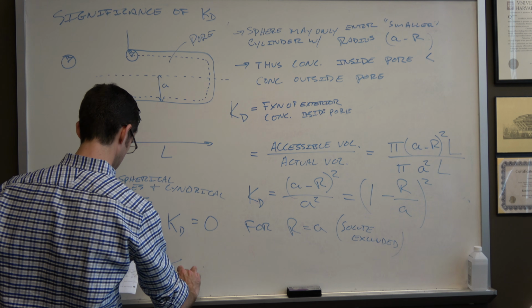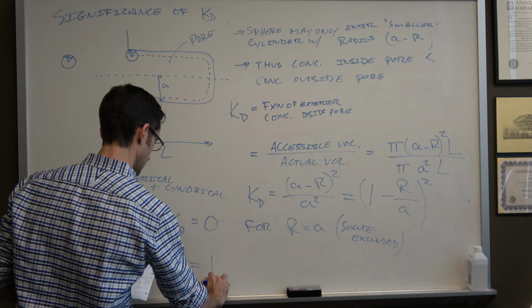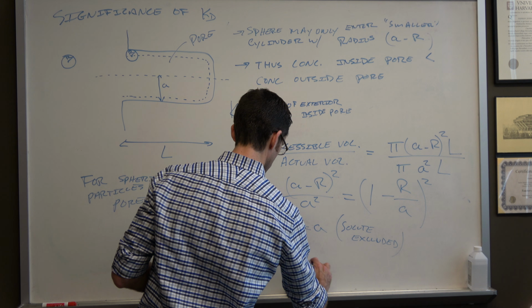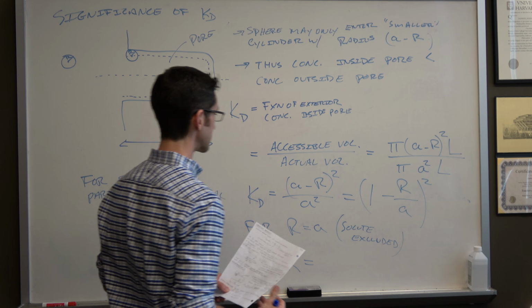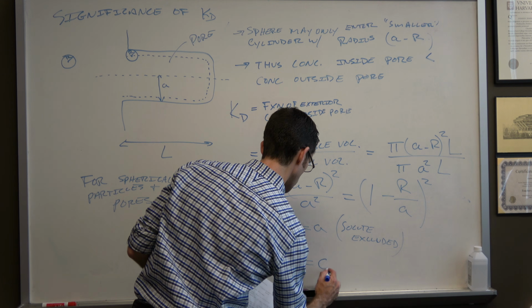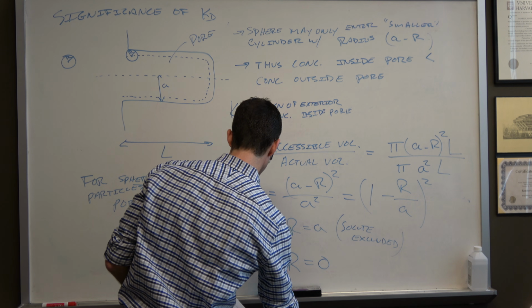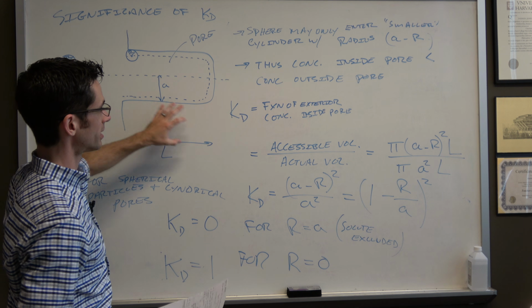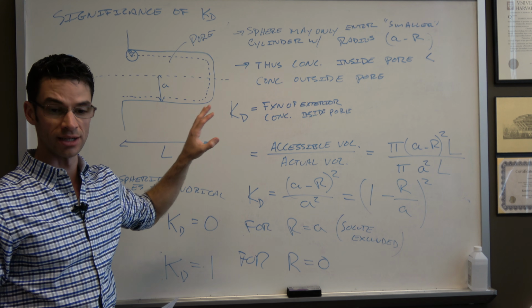And as the solvent or solute radius approaches 0, Kd equals 1, and that means that the entire interior of the pore is included.